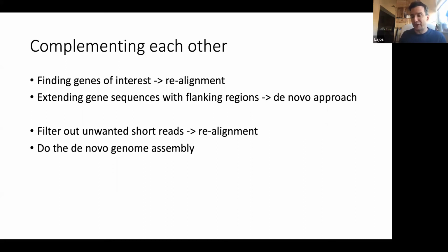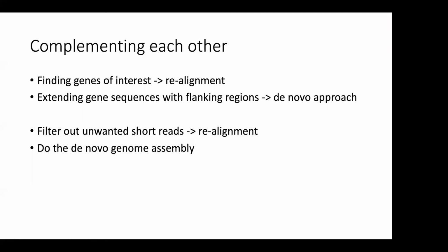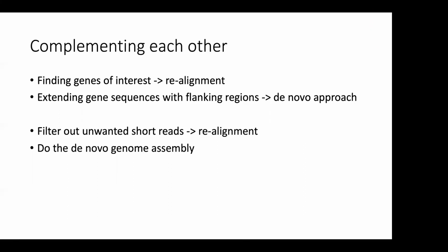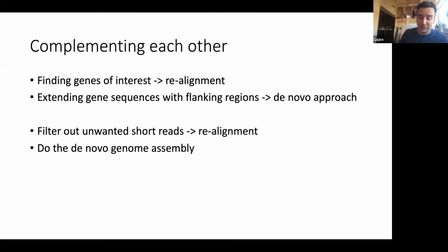So what you actually do here is that it's like an affinity chromatography. Your affinity beads are your reference genome, and you are not keeping the things which are hybridizing or attaching to the beads, but you are keeping the flow through, and you are working with that data forward.